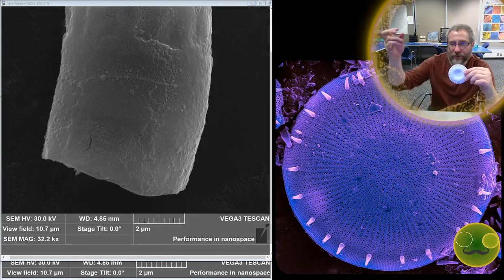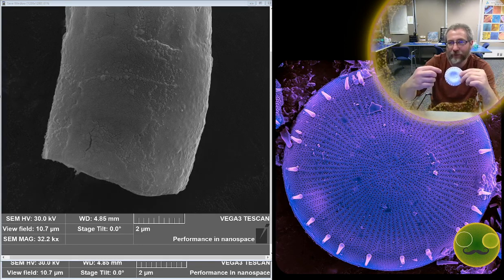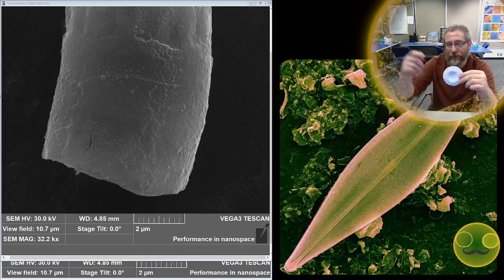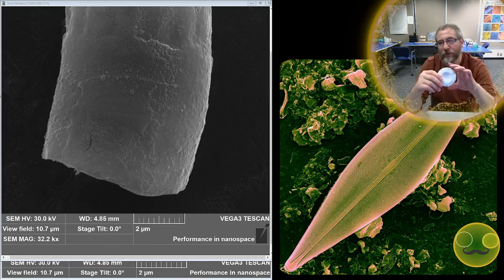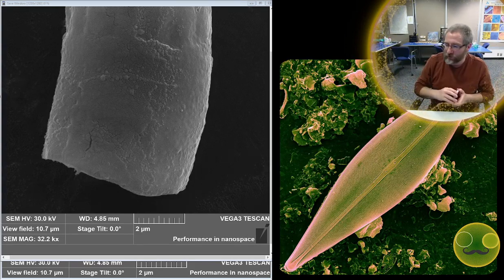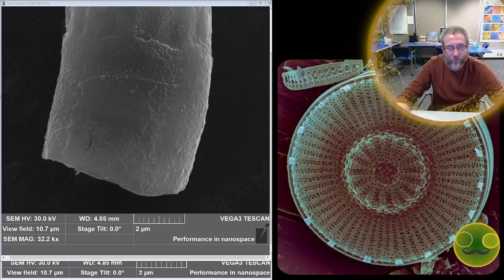Basically, the light in this case would be electrons that are hitting it, and when things are pointed away from the camera, some of the light is reflected in the wrong direction, so it's darker. In the SEM, the same thing happens with the electrons. They come in, hit a surface, and then come out of that surface. If the surface is pointed towards the sensor, then it's bright, and if it's pointed away from it, it's dark. So it's just using the number of electrons that are coming in, the density of them, basically, and it captures those.